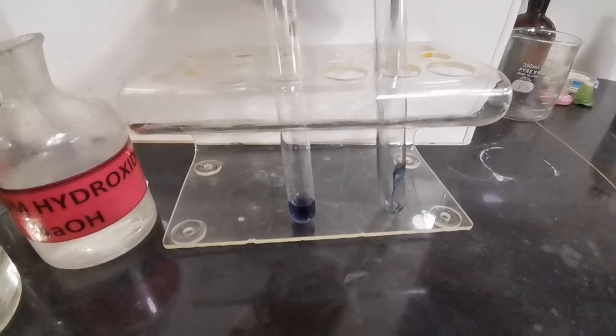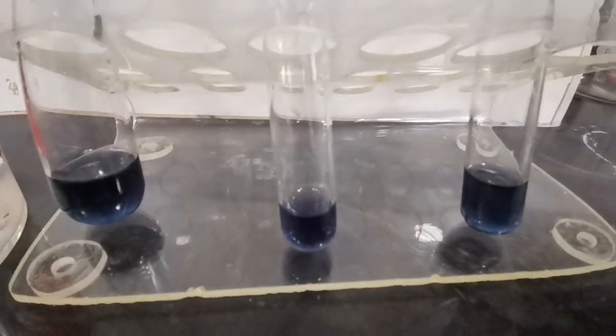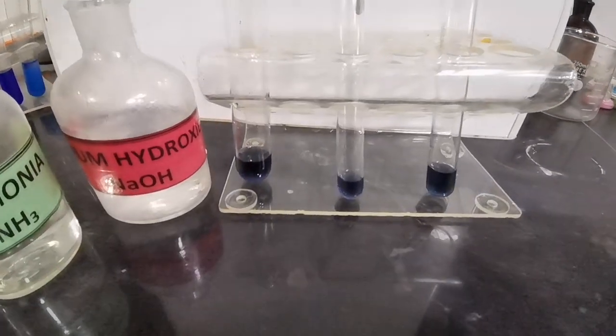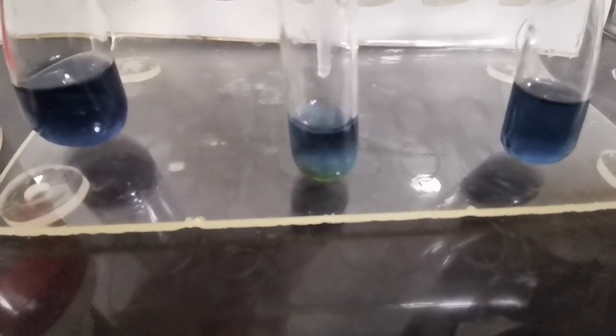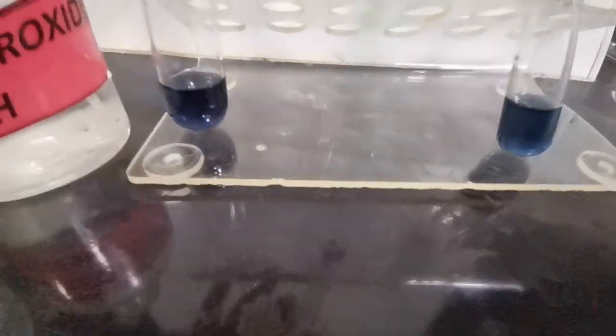We will start off the test by adding aqueous sodium hydroxide dropwise to our solution. Here we are adding a few drops of sodium hydroxide, and this results in the formation of a precipitate. This is sort of a gray-green color.